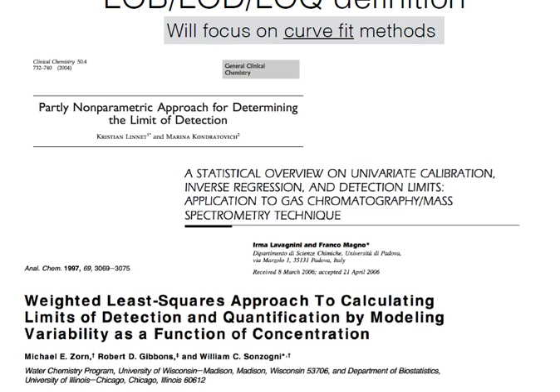So this is the LOB, LOD, LOQ definition. In this talk, I'm only going to talk about methods that are based on a curve fit, not methods that are just based on the blank sample, for instance. This is the article that we just talked about, which is today the most used method. You can also find a very good presentation in this review article here, and then it's also discussed here.